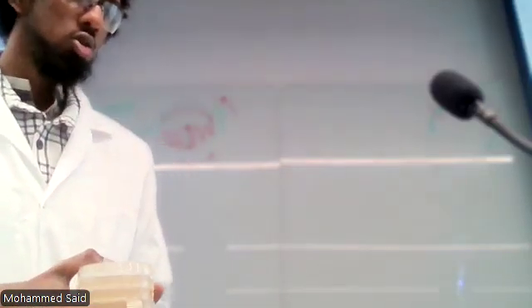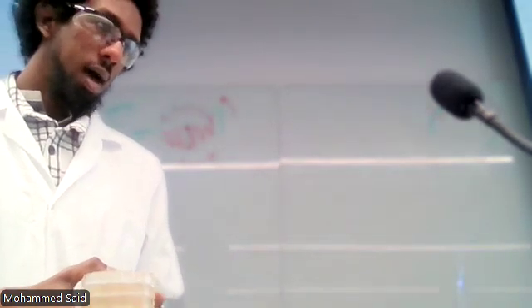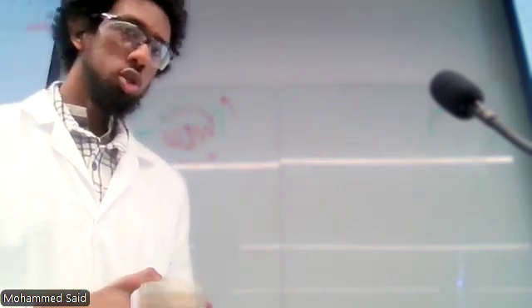So you have a P1000. Hopefully you all know how to use pipettes. If you don't, just let me know. But if you have a P1000, you could go to 010, that's 100 microliters or 0.1 mils. And similarly, 0.9 mils for J53R is 090.